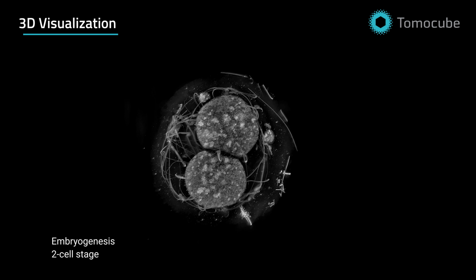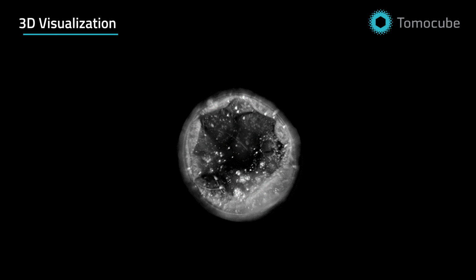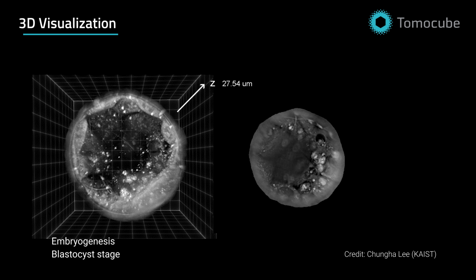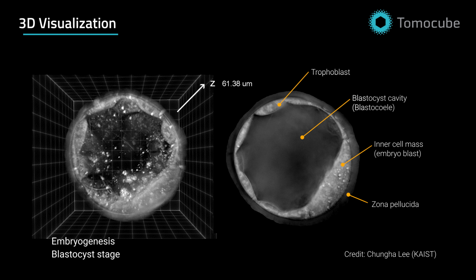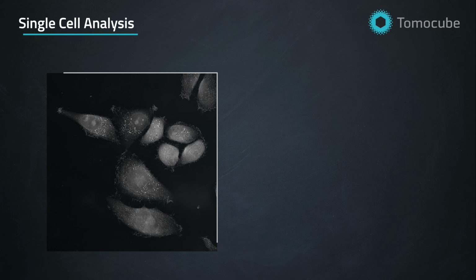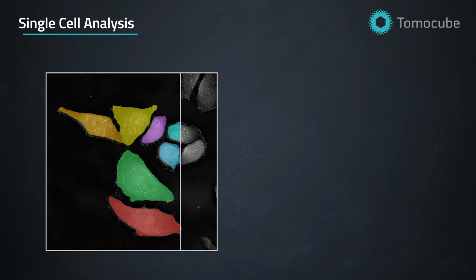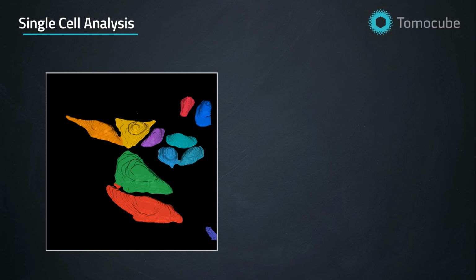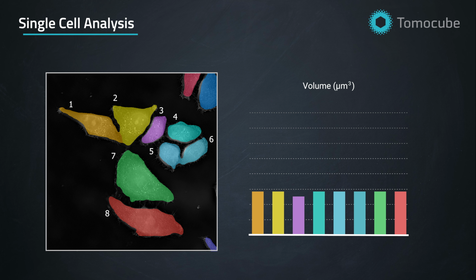TomoAnalysis 3D visualization brings your samples to life, delivering exceptional clarity and depth. TomoAnalysis goes beyond visualization to offer powerful single-cell analysis. With refractive index-based thresholding and AI-driven segmentation, researchers can quantify cellular features with precision and efficiency, unlocking deeper insights into cell morphology.